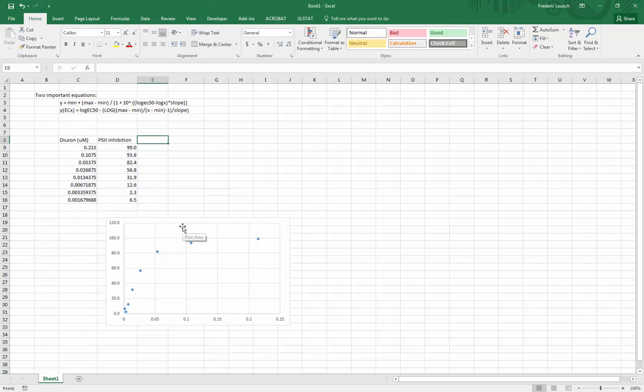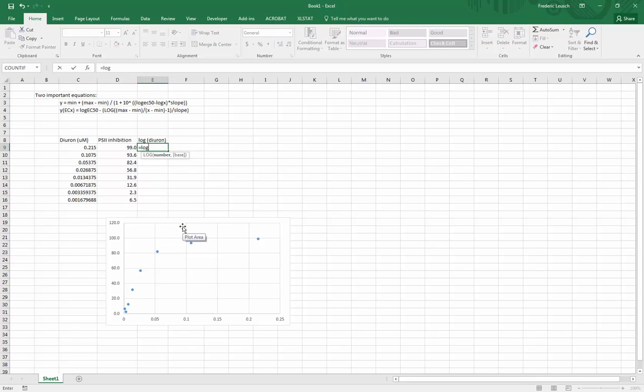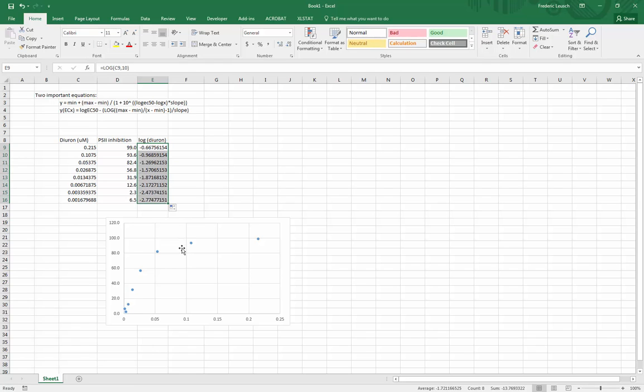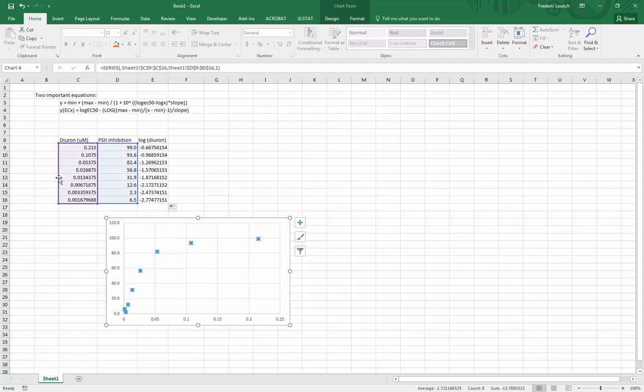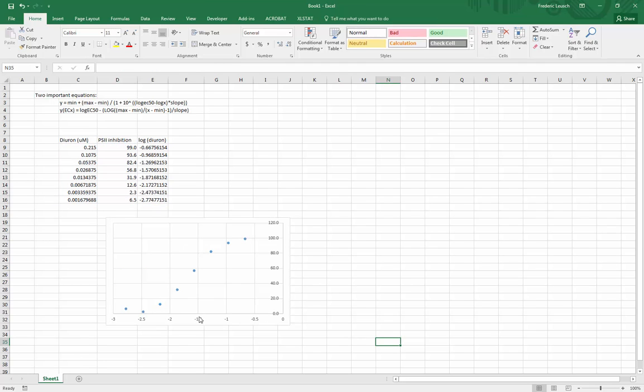I'll calculate it because I will actually need these values. So log of diuron here equals log of the diuron concentration on a base 10 and drag it down here. So this is my log value. So I can just now click on my data and slide it across to show I want to plot the log diuron.